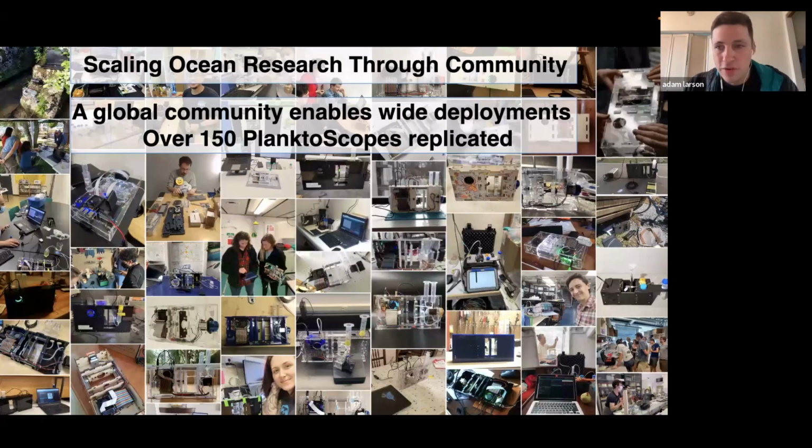And so through COVID, we had over 100 people making these microscopes. So we put the plans up online, we put a few guides on how to replicate, and it was honestly just really humbling and very impressive to see how resourceful people are, making the instrument out of an incredibly diverse body of materials and hacking it, making it in their own way. But we saw people were able to replicate this, and they were super excited to take data on plankton and really help us make the instrument better. So through this community, we've iterated many different versions of this device, and it is where it's at now because of this community using the machine, making the machine, hacking the machine, and making it much better.